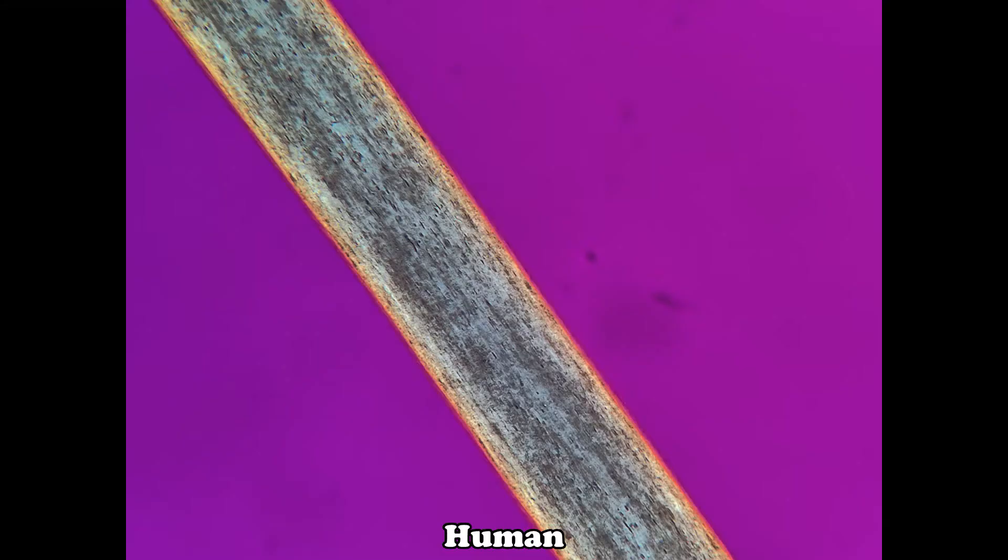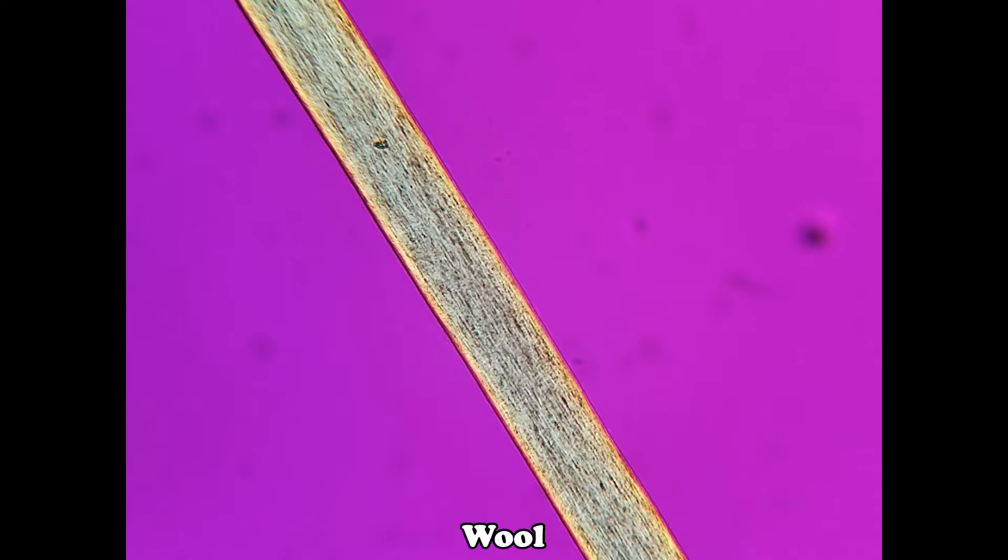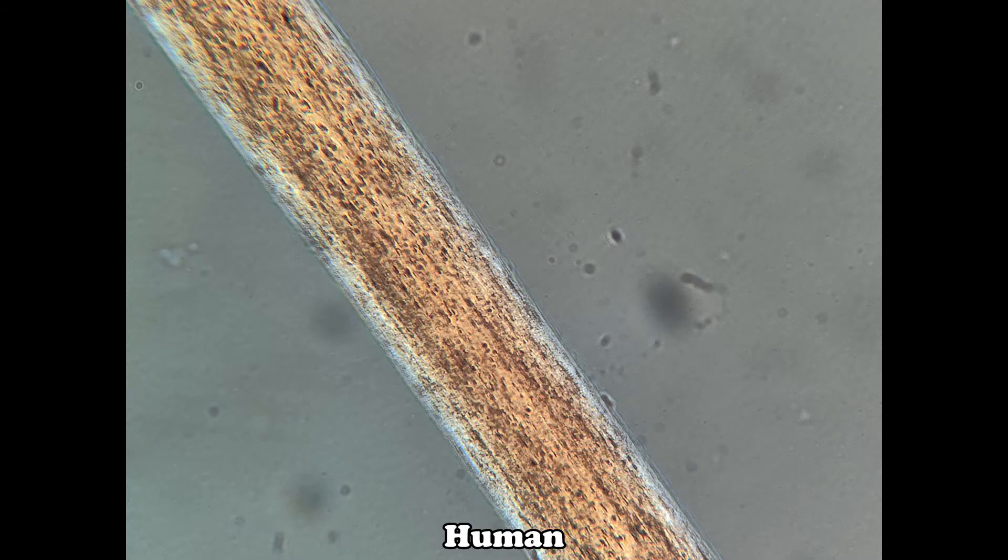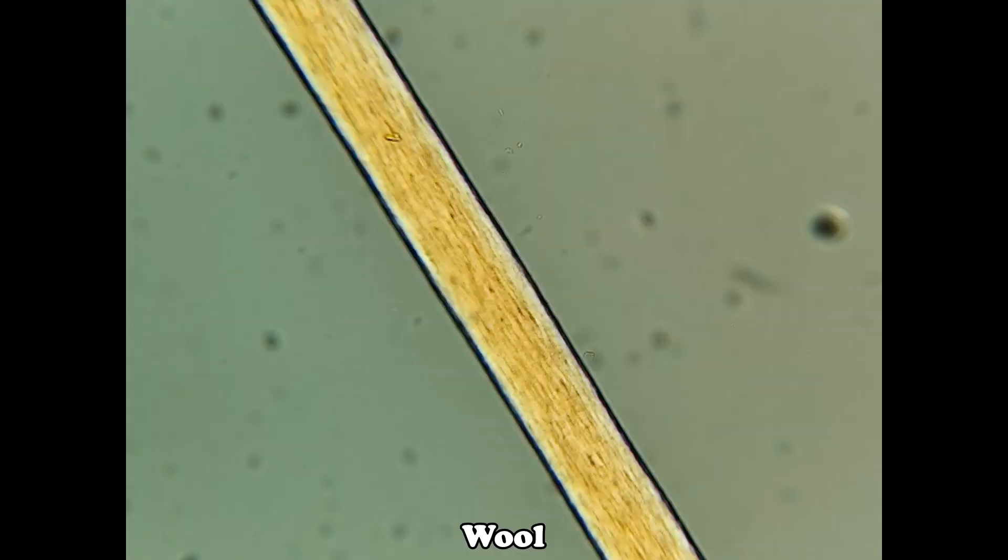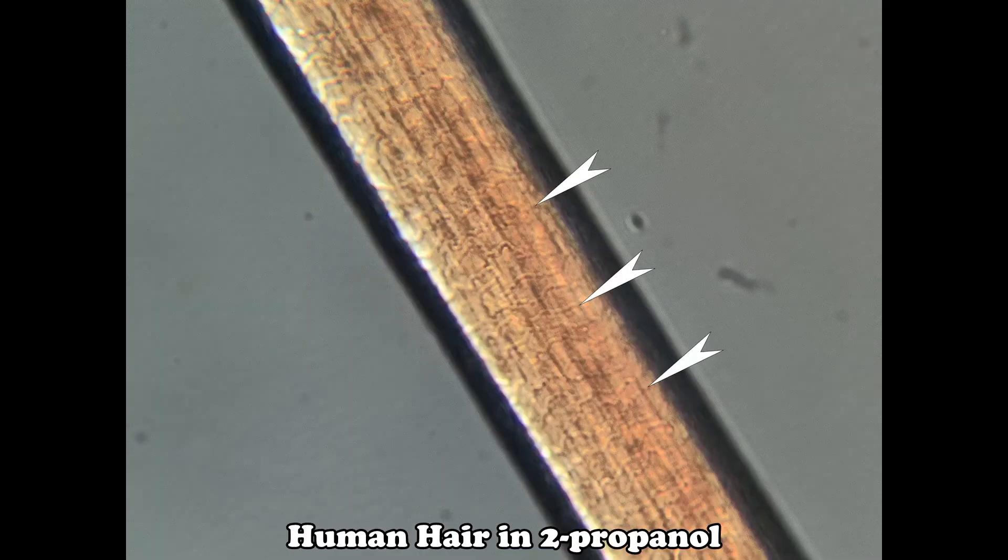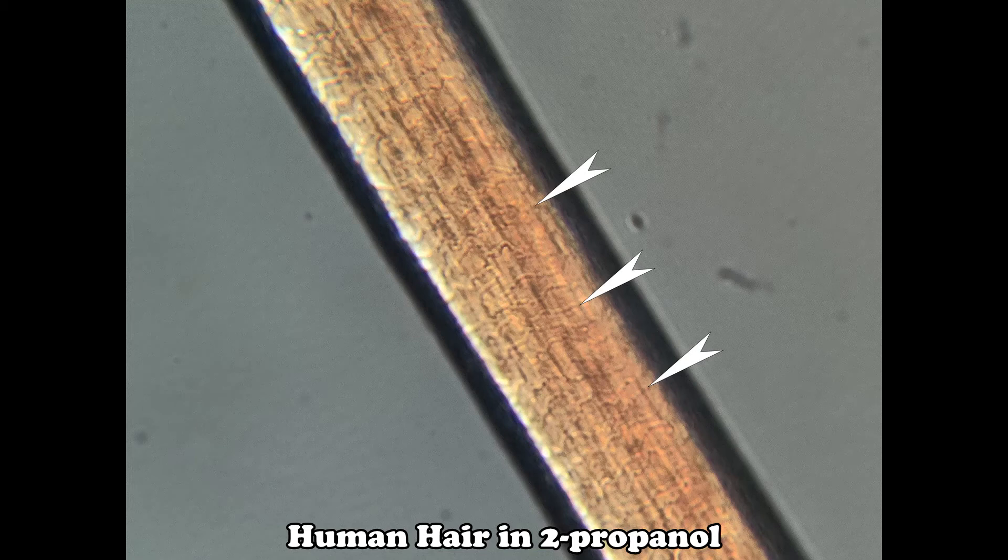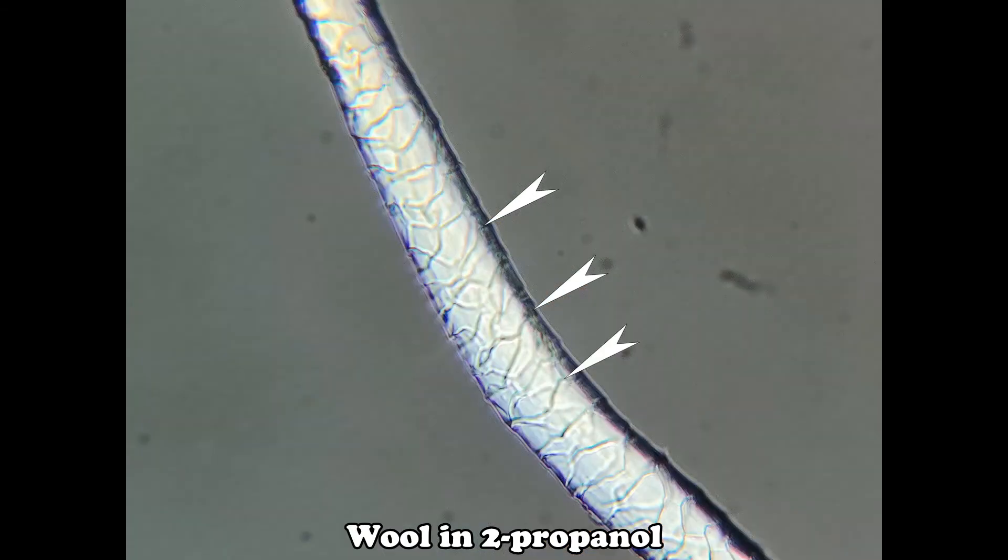Here's where your refractive index medium really makes a difference. When you're prepping something that has the same refractive index as your liquid, in this case, 1-5-5 liquid and hair, which is roughly the same refractive index, you lose relief. When you're looking for hair scale patterns, which is what you're going to need to differentiate human hair from wool, get rid of the refractive index oils altogether. Use propanol or water.